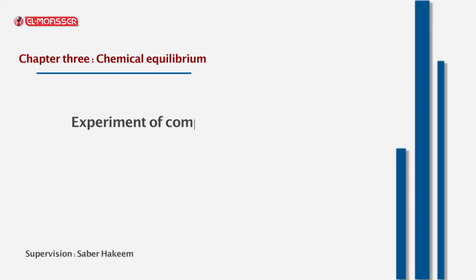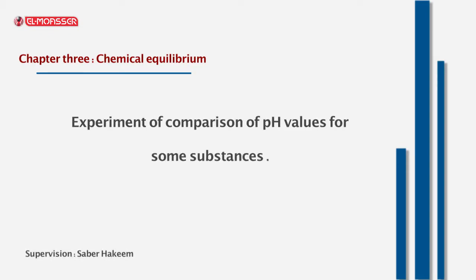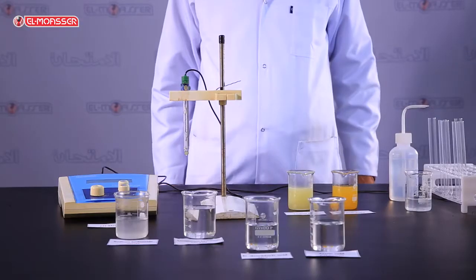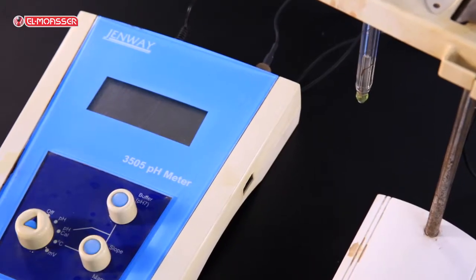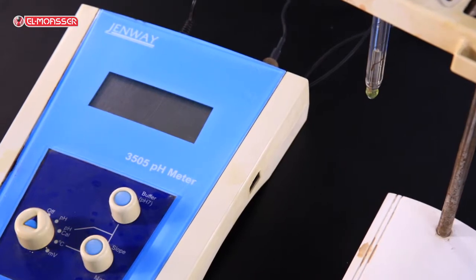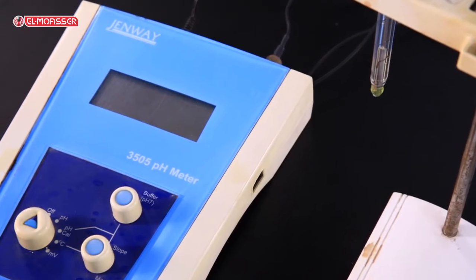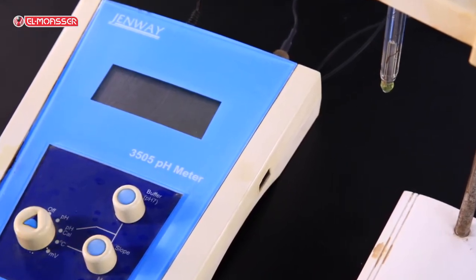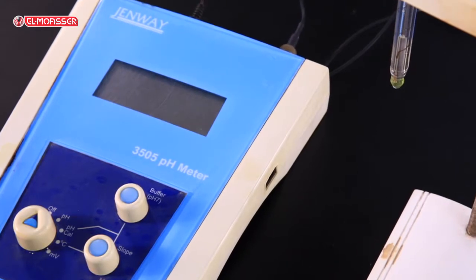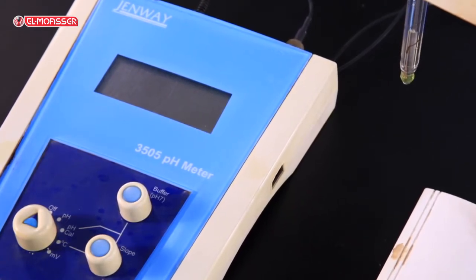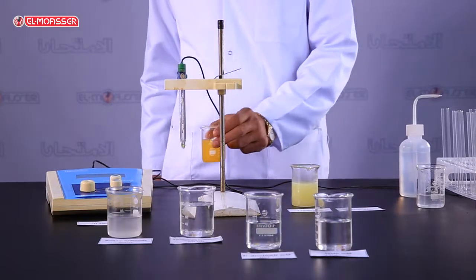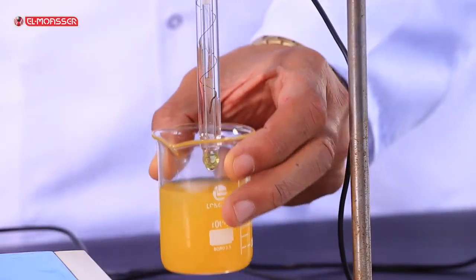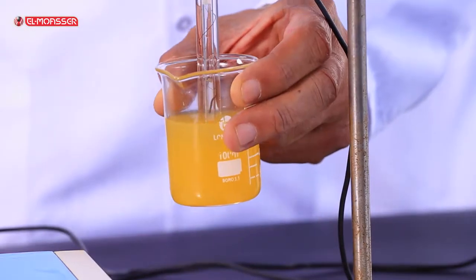In this experiment, we compare pH values for some substances using a pH meter to measure the pH value of different substances, so you can compare their acidity or basicity. The pH value of orange juice equals 5.01.